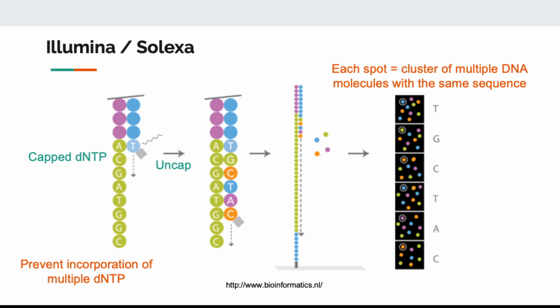This is where Illumina technology solves the problem. Instead of letting the polymerization reaction occur more than once, where if you put in a G you can have two incorporations, two polymerization reactions, Illumina technology blocks the polymerization by putting a molecule tag at the OH site. These molecules block the polymerization reaction. Even if you have 3 A's, only 1 T will be incorporated because these molecules block the polymerization.